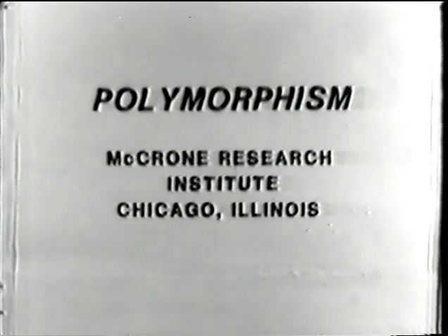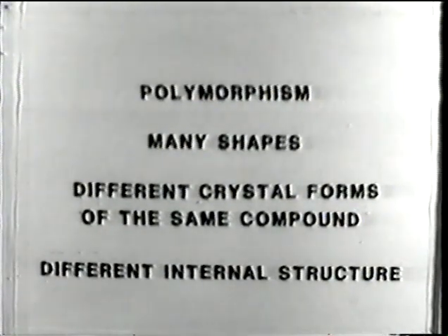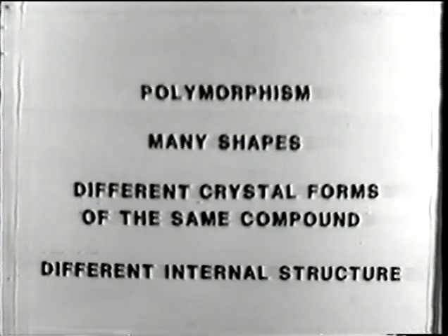Different crystal habits: rods, needles, plates, and so on. Any crystalline compound can do that, depending on the crystallization conditions. Polymorphism infers different shapes, but also different internal structures. Each polymorph will have a different internal arrangement of atoms, corresponding to different free energies.